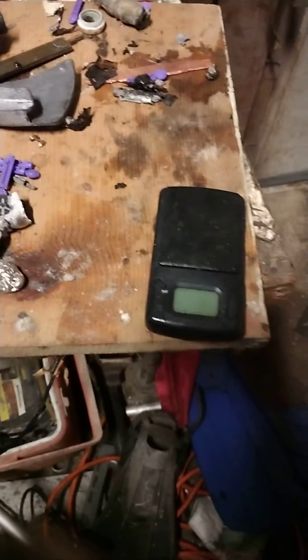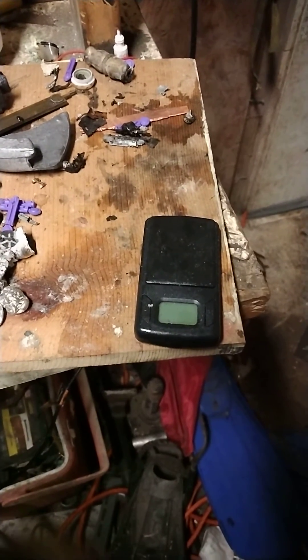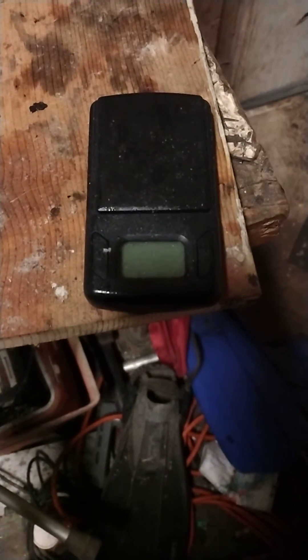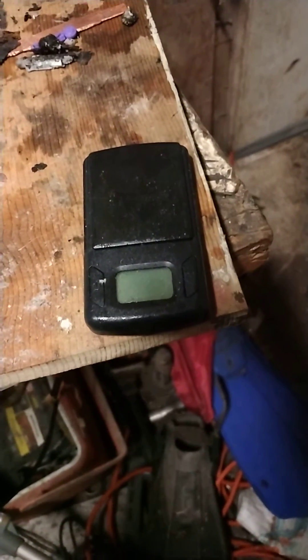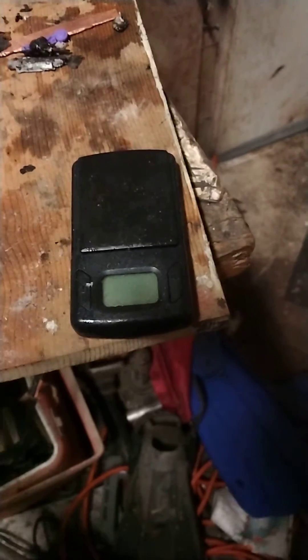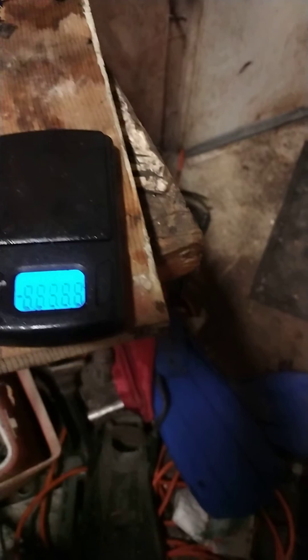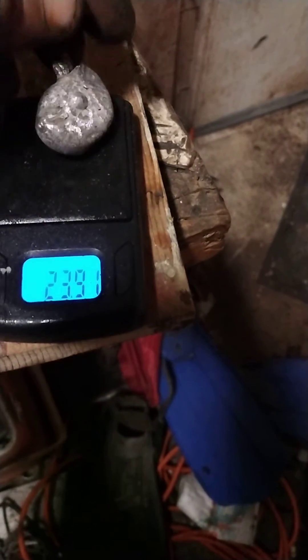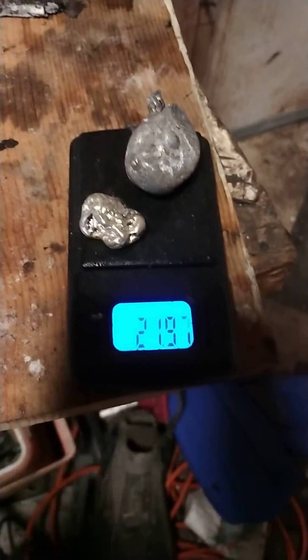It took me five months to get pure rhodium — not alloyed with something else. It's still great because it's worth a fortune, but it always had ceramic or carbon left in it. But try and try again, and you end up getting whatever it is you are working for.